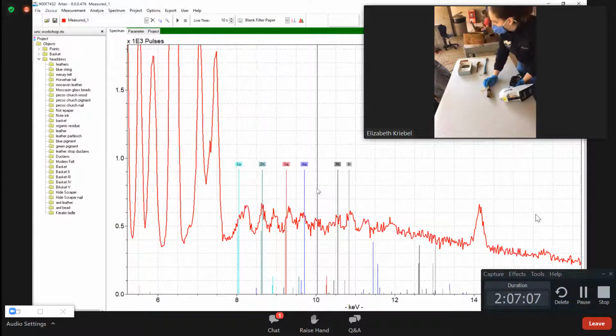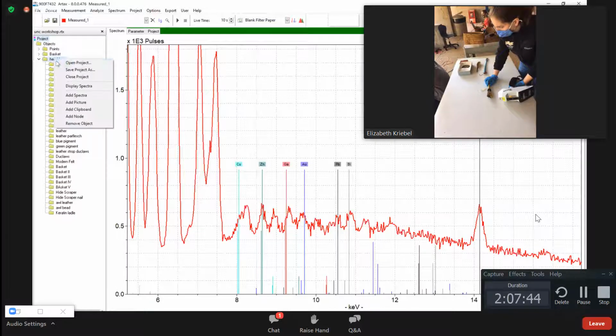I see. So for those of you who see my screen, this pattern is extremely anomalous. It looks to me like coherent scattering, like it's a crystal, but that's obviously not the case with this object. Maybe there are quartz crystals in it, quartz rocks inside. The surface would have to be crystalline, and that's obviously not the case. It's just a really weird pattern. We need a filter, I think, to really reconcile a lot of what's in this. But let me add this spectrum. Rattle, dark color.